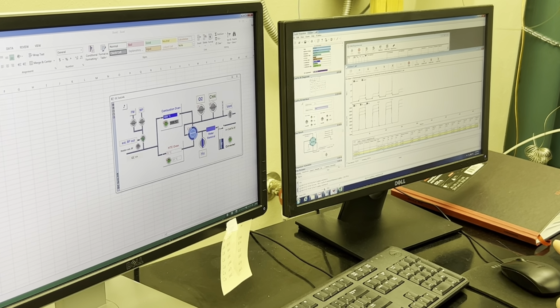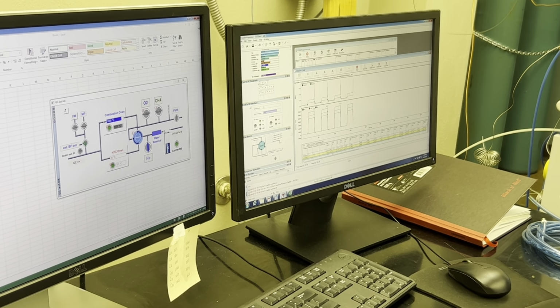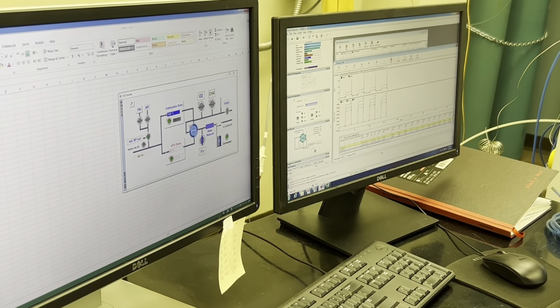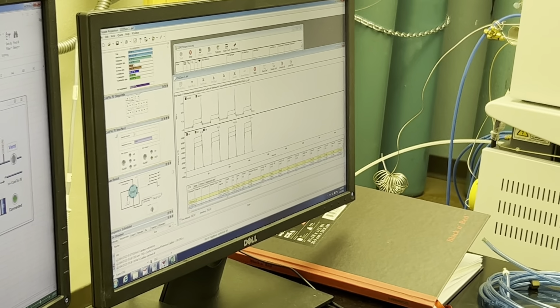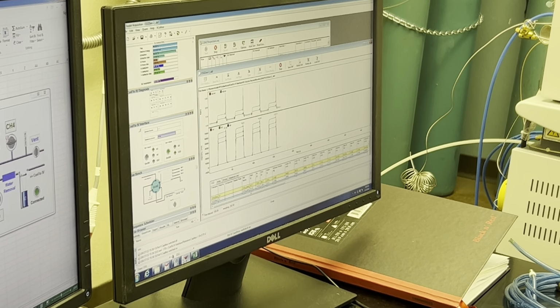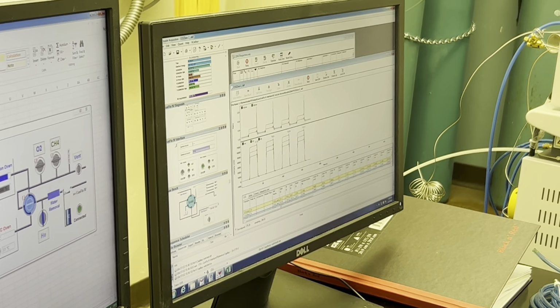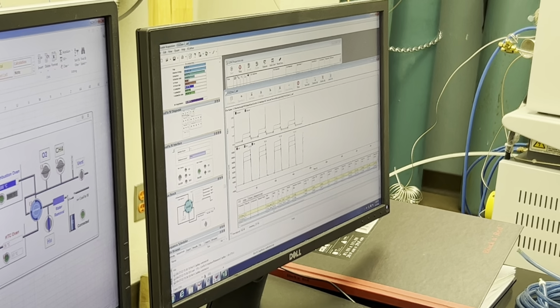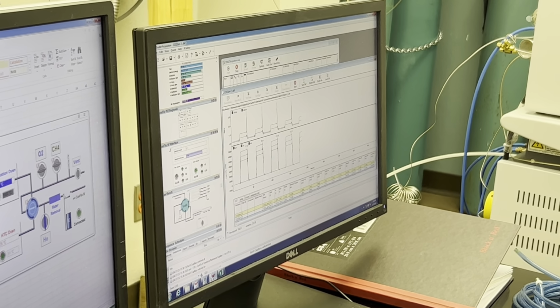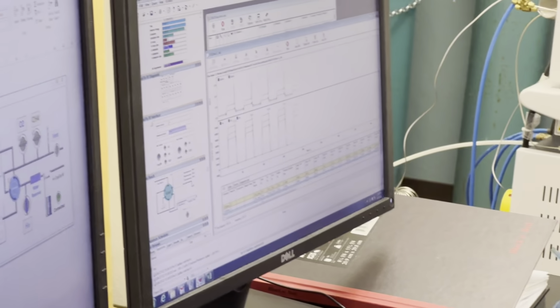So this is looking better already. The peak shape looks a little bit better, and the intensity is not increasing. One reason the intensity could be changing is that all the gas in there is still reaching equilibrium. We saw mass 18 going down, argon was decreasing. We want to make sure everything's stable before we believe any of these numbers, and it really wasn't. I just wanted to see if this was completely screwed up, and it's not. It's still functioning. For all intents and purposes it's working. But obviously we're going to go through with the whole insurance thing.